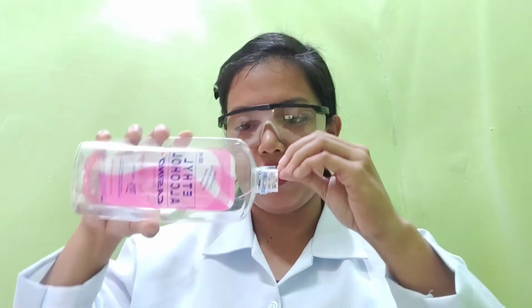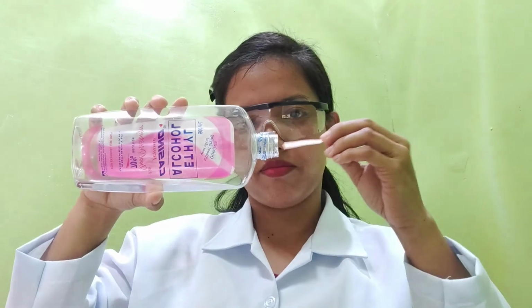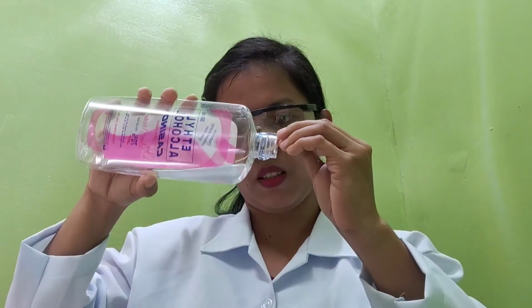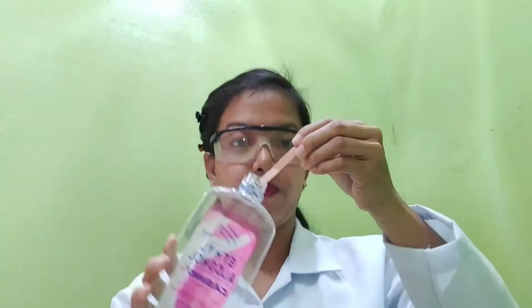Okay. Now we will check an alcohol. This is what we call an ethyl alcohol. So we will check if it is an acid or a base. Let's find out. Here, the red litmus paper is still the same, it's still red.